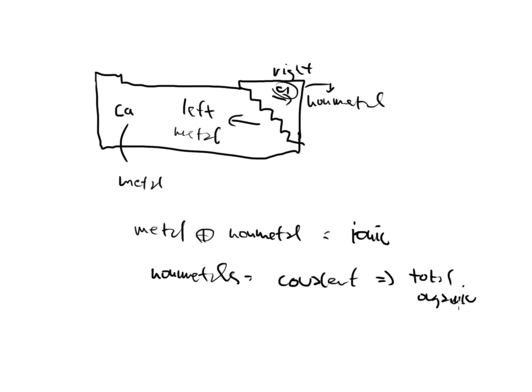So let me give you an idea here. Let's say that we bring in a carbon-based and a non-carbon-based molecule. The non-carbon-based would be NaCl, salt. If you look on your periodic chart, Na would be over to the left, and Cl would be over to the right, so this is classified as inorganic.